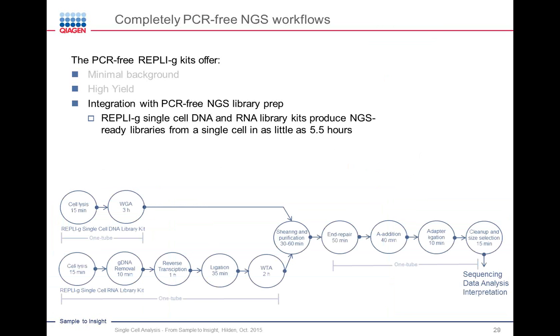Yeah, so we offer them on their own as just the whole genome or whole transcriptome application, but then we've also integrated these with completely PCR-free NGS library preparation protocols, where these are two tube protocols. Typically, we do the whole genome amplification or the whole transcriptome amplification in one tube. This takes a few hours in all cases. It's sort of the longer part of this protocol. And then after shearing the DNA, we can go into end repair, A-tailing, adapter ligation, and cleanup.